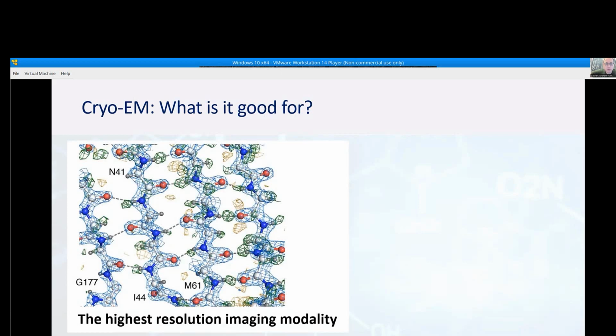There are other methods, such as spectroscopic methods, where some of the information is inferred indirectly. However, cryo-EM is a microscopy method. In other words, we are striving, and getting closer and closer to the day that we will be able to slice a piece of a cell, look inside it, and see the molecular structure in atomic detail inside the cell. On the left, you see one of the world records in resolution. The final output of this method is an electron density map, described here as the blue, green, and yellowish webs. When the resolution is high enough, in principle, a person can track these clouds and start placing atom by atom, and therefore get a very clear understanding of the chemical model that underlies biological phenomena.